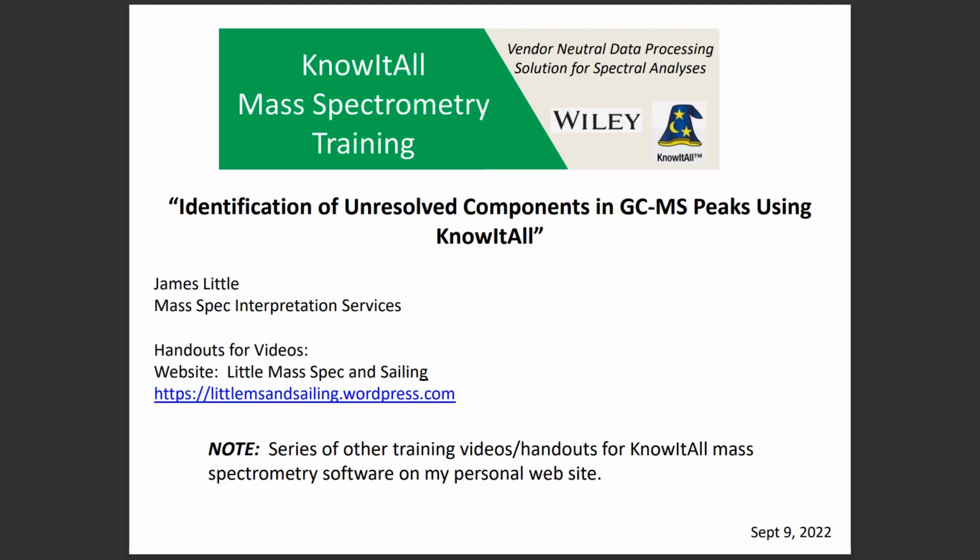Wiley has introduced new mass spec capabilities within their KnowItAll software. KnowItAll is a vendor-neutral data processing solution for spectral analyses. I have created a series of these training videos for the software, which can be found on my personal website.